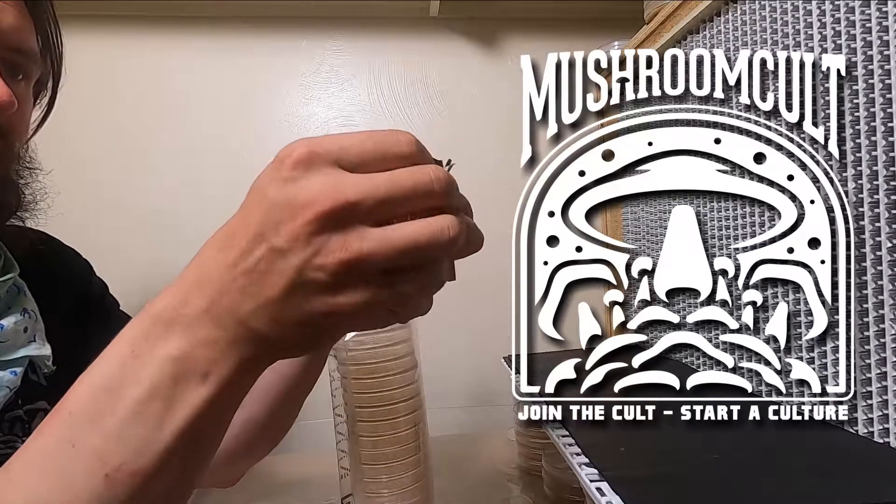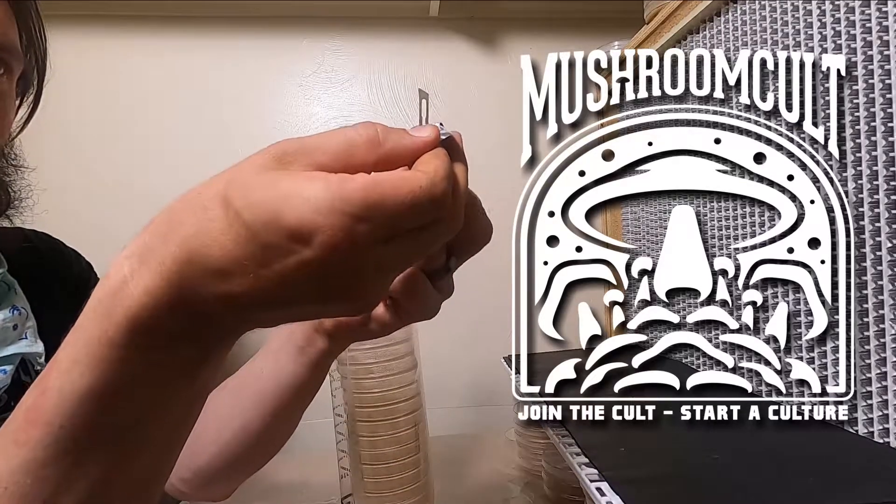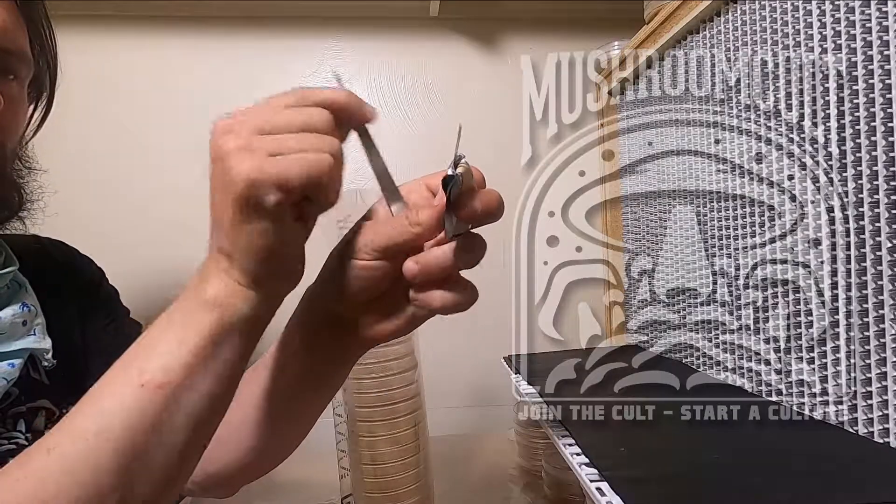Cloning the Calvitea Puffball with Mushroom Cult. First I'm going to get my blade ready, get my workstation ready.